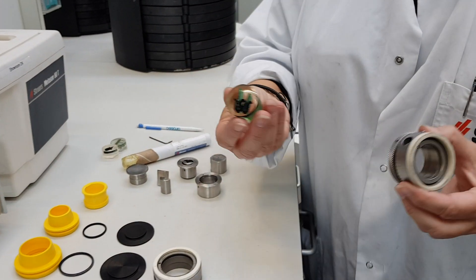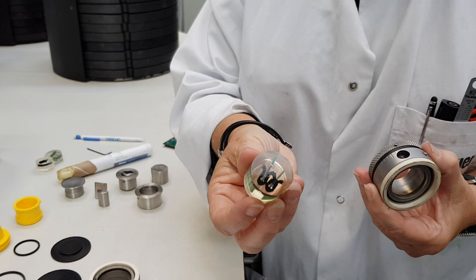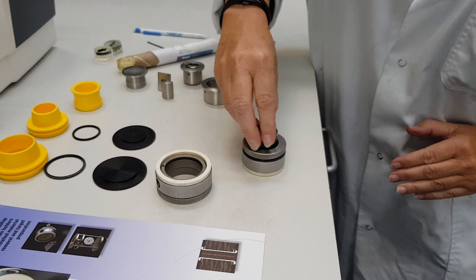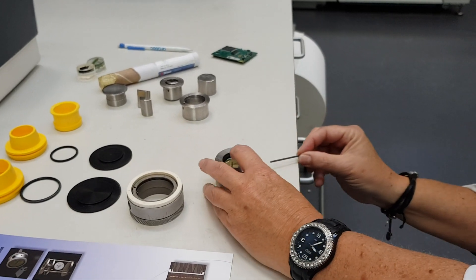Here I have a sample with some micro-electronic samples inside, already mounted. What I do is find a flat surface, put it like this, and put it inside. I use an allen key to tighten.